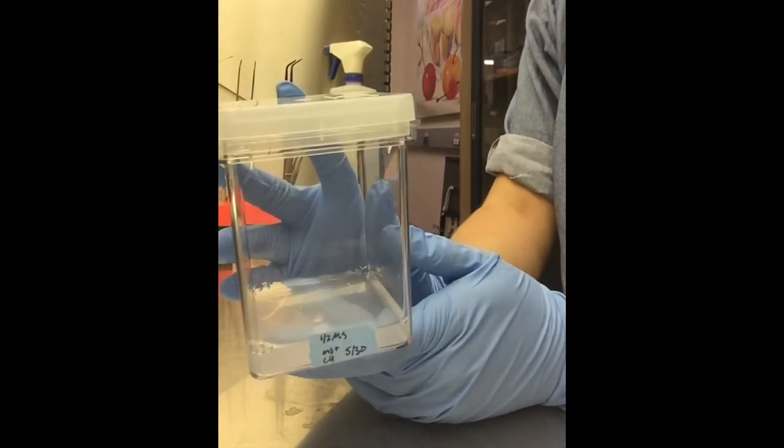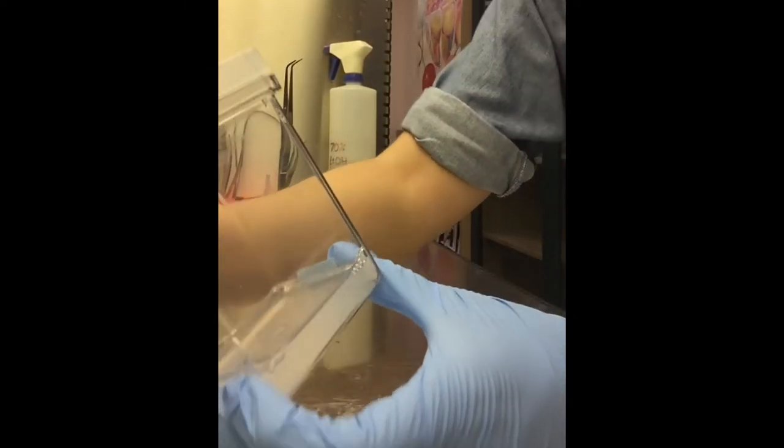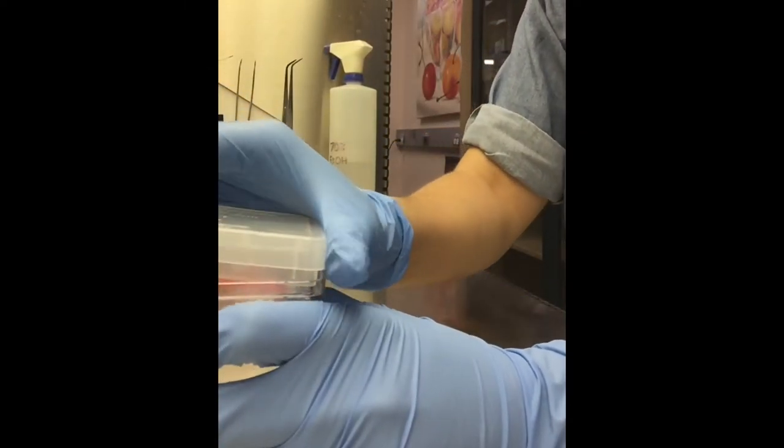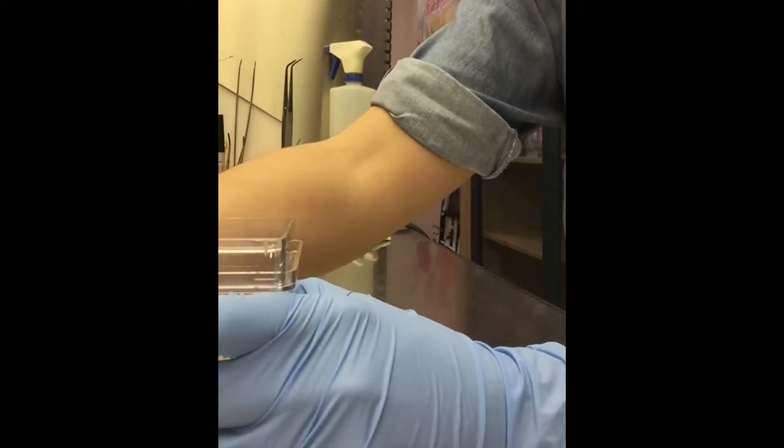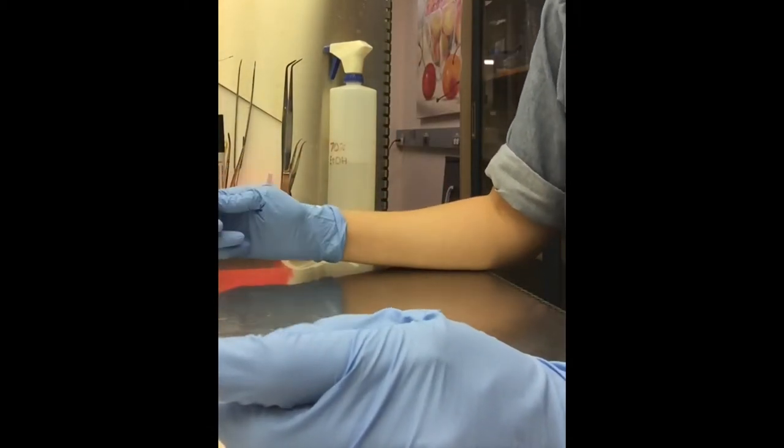Get out one of our GA7s. This has our half MS media. The reason we use half MS instead of full MS is because the seeds don't need all of the nutrients that are in the full MS, so it would be a waste to make it full.